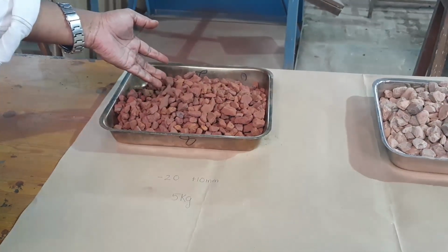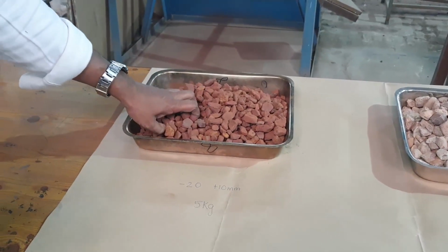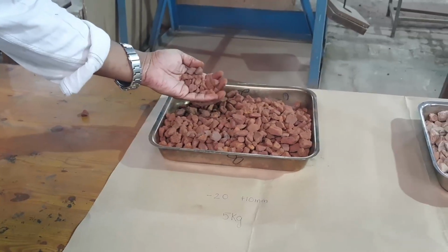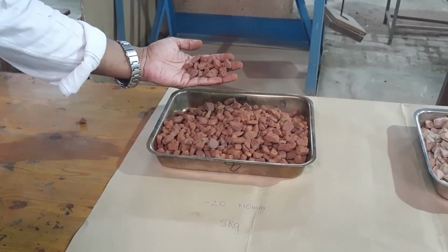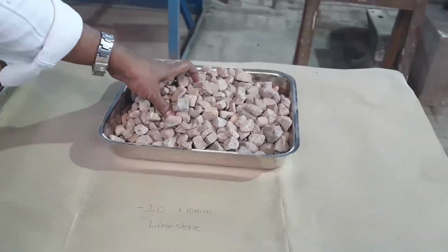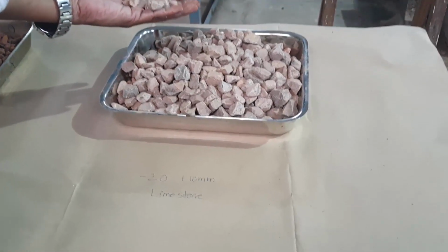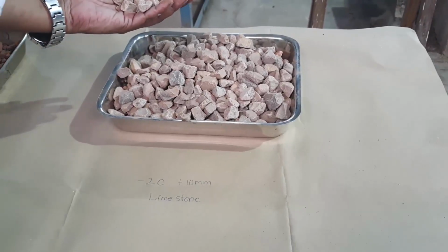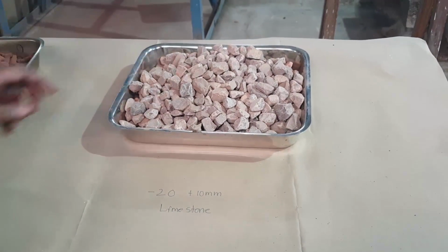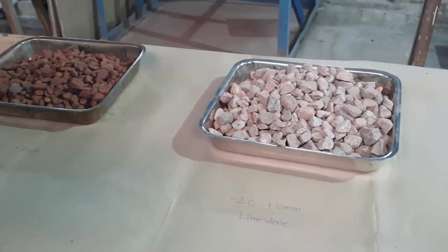Generally we should take 20 kg for the experiment, but for laboratory purposes we don't have that much quantity, so we are taking 5 kg of minus 20 plus 10 mm iron ore. And one more raw material used in the blast furnace, limestone, also of size minus 20 plus 10 mm. This also we are taking as 5 kg only instead of 20 kg: 5 kg iron ore and 5 kg limestone.